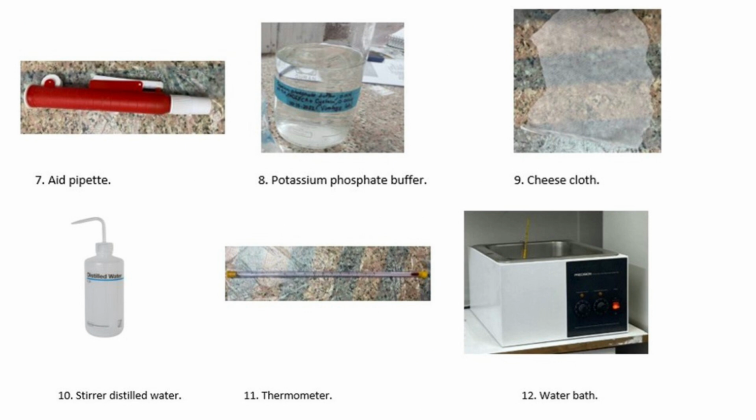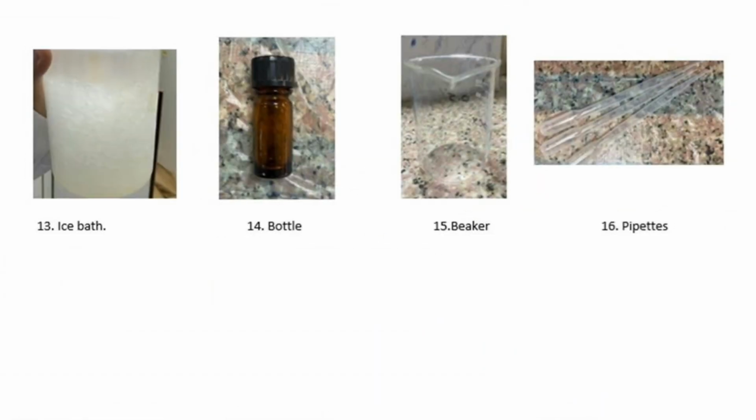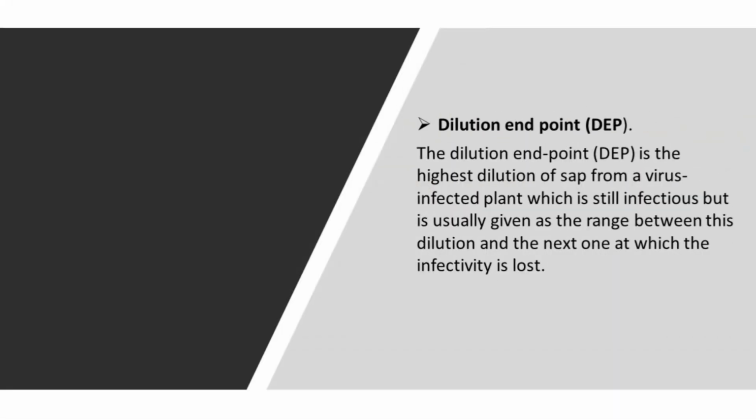Pipette aid. 8. Potassium phosphate buffer. 9. Cheesecloth. 10. Sterile distilled water. 11. Thermometer. 12. Water bath. 13. Ice bath. 14. Bottle. 15. Beaker. 16. Pipettes.